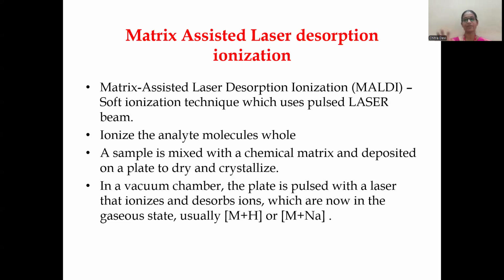The sample which cannot be converted into vapor form will be mixed with this chemical matrix, deposited on a plate, and dried, and after crystallization this can be used for ionization. Here the whole mixed compound, the sample with the matrix, will be used for ionization. Okay, this is a soft ionization technique.